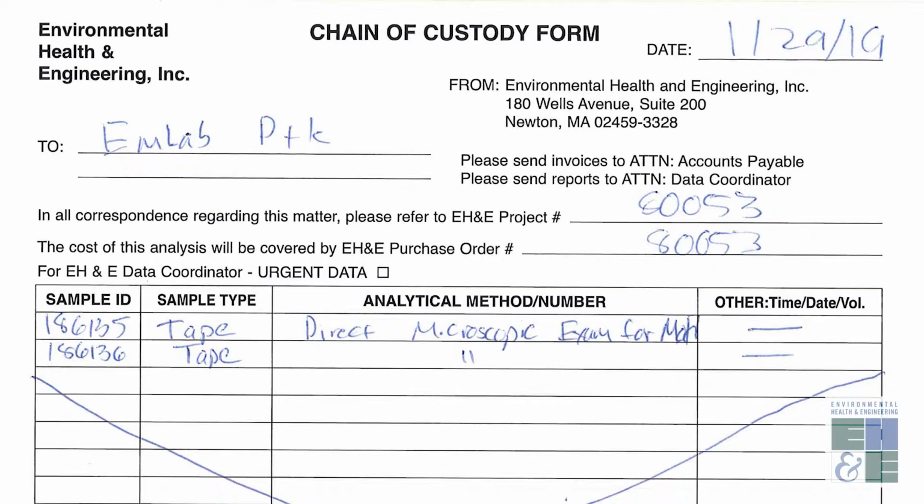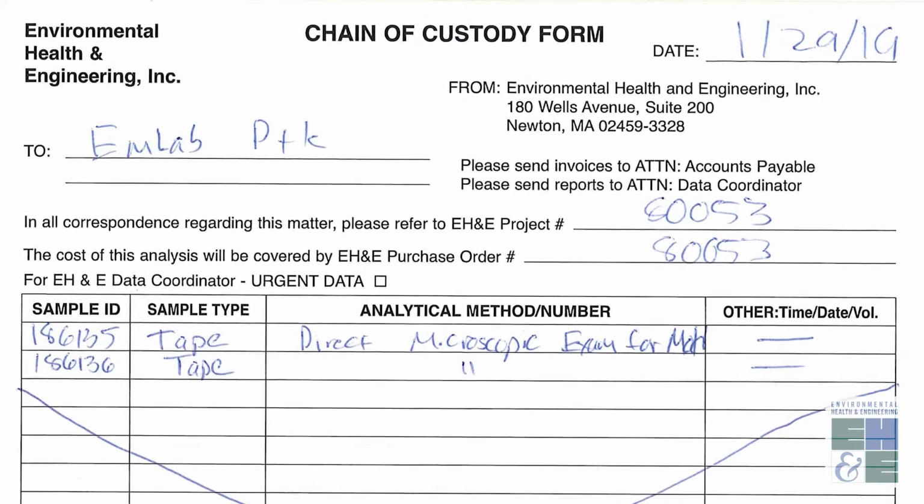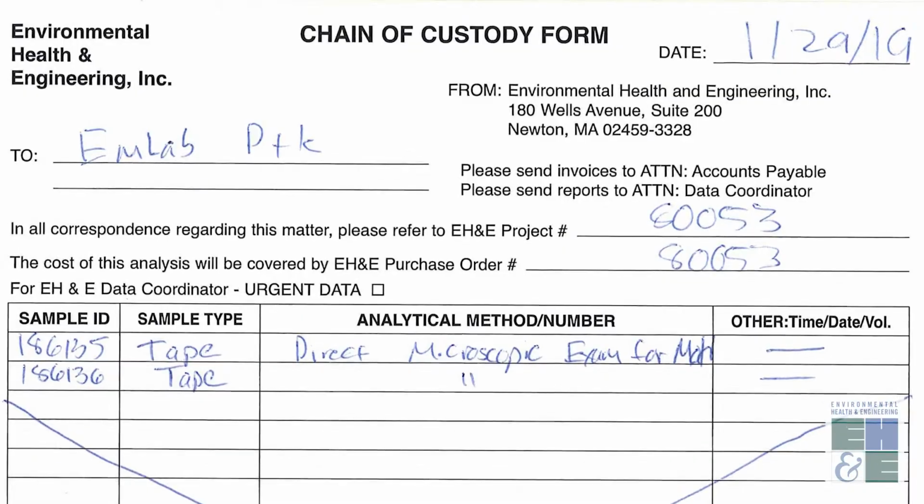So the chain of custody form is standard to EH&E. We fill out first the date, and then 2. If it's going to a laboratory, that's who it should be. So for example, I'm going to fill this out to MLab P and K. We also need to document the EH&E project number, 80053. And if we have an EH&E PO number, if we don't have it, we can also use the project number for the PO number.